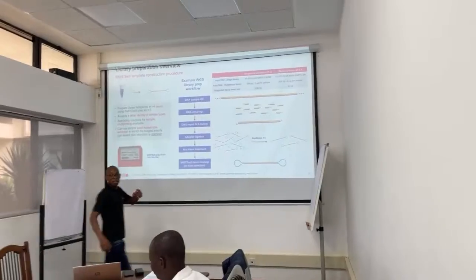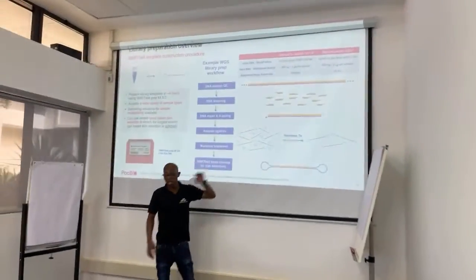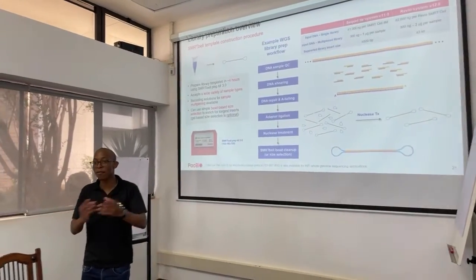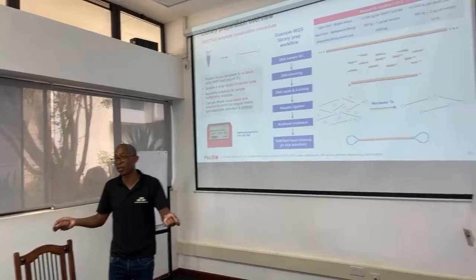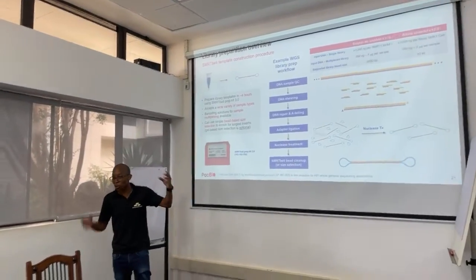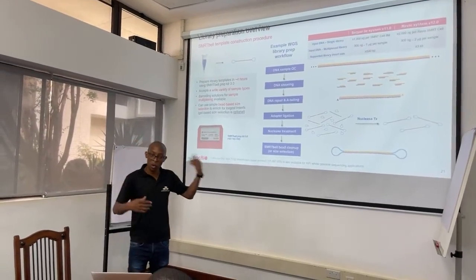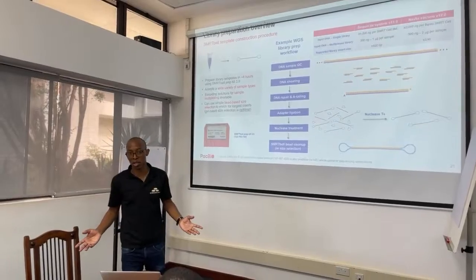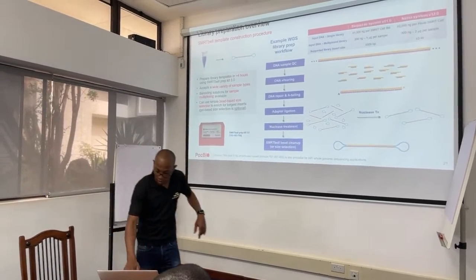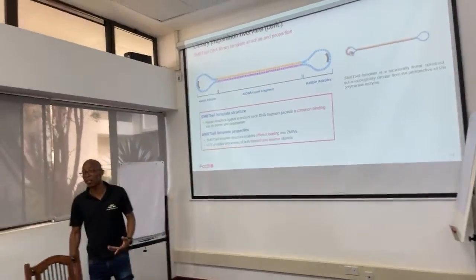So yeah, we can just take them nicely and then continue. It's a combination of enzymes. Basically, they are there to digest everything that is not a complete library. If there's an adapter floating around, those enzymes will digest it. If there's a fragment floating around without adapters, those enzymes will digest it. It's more like a cleanup step, to make sure that we end up with this nice complete library.